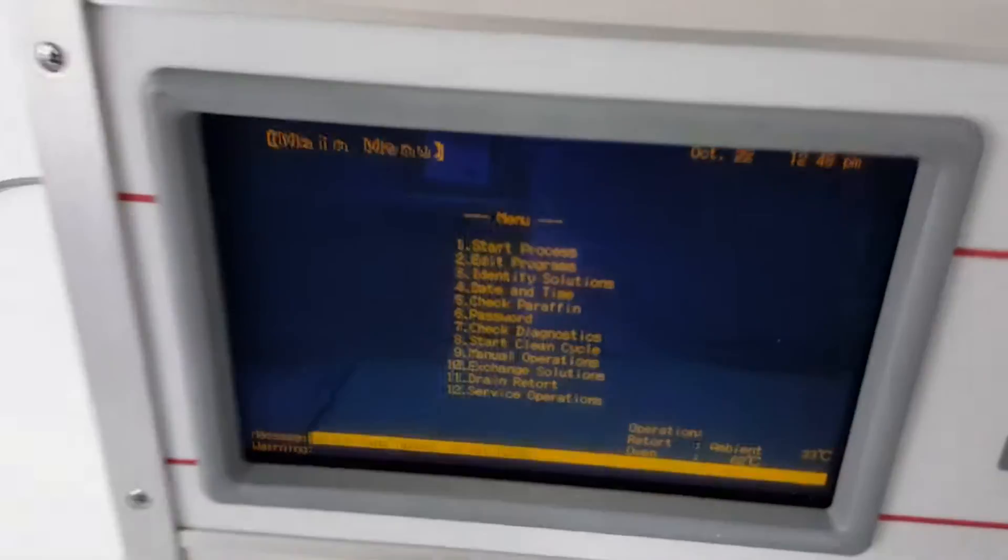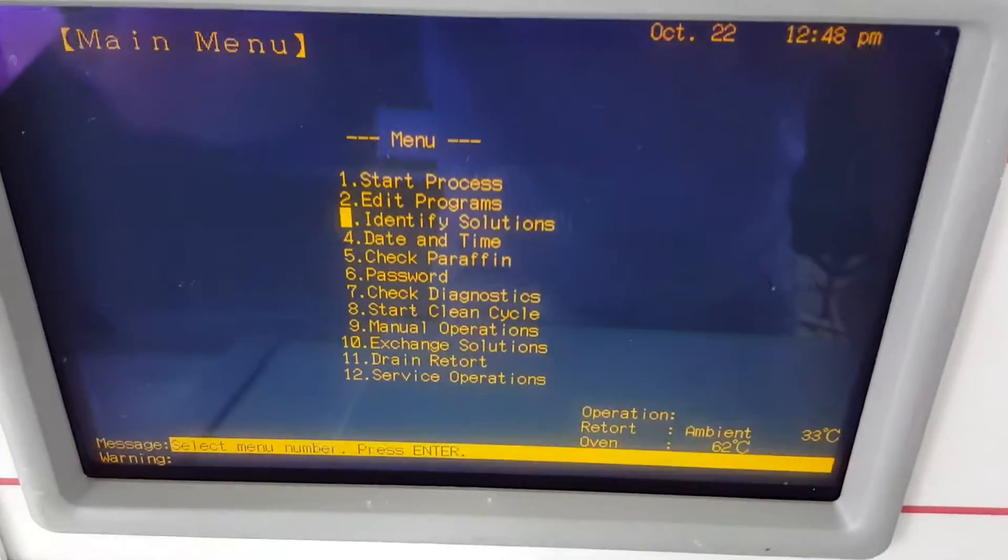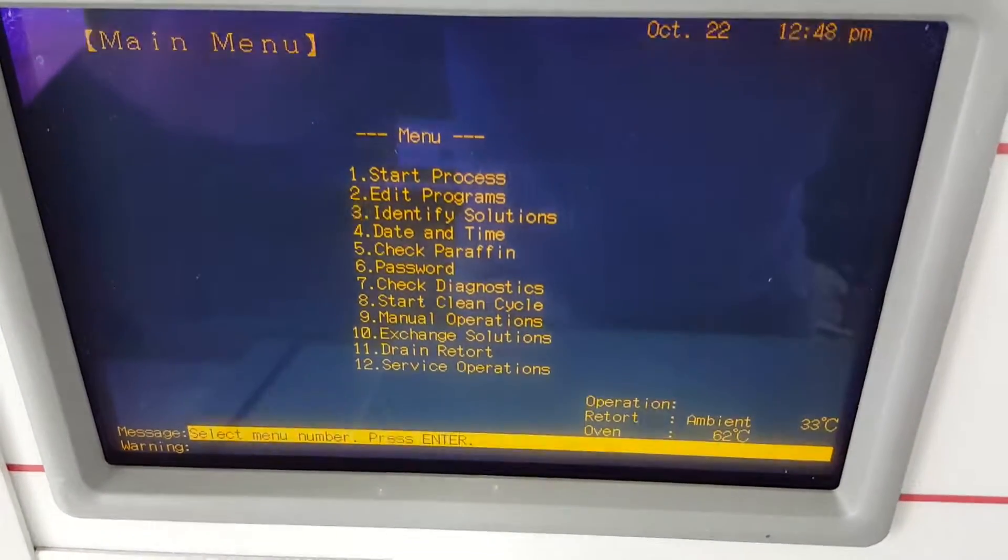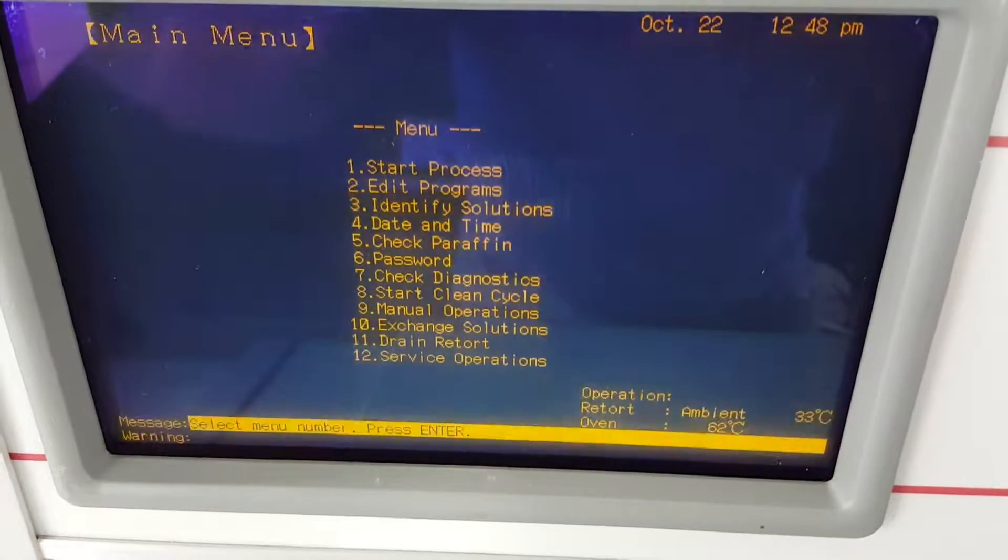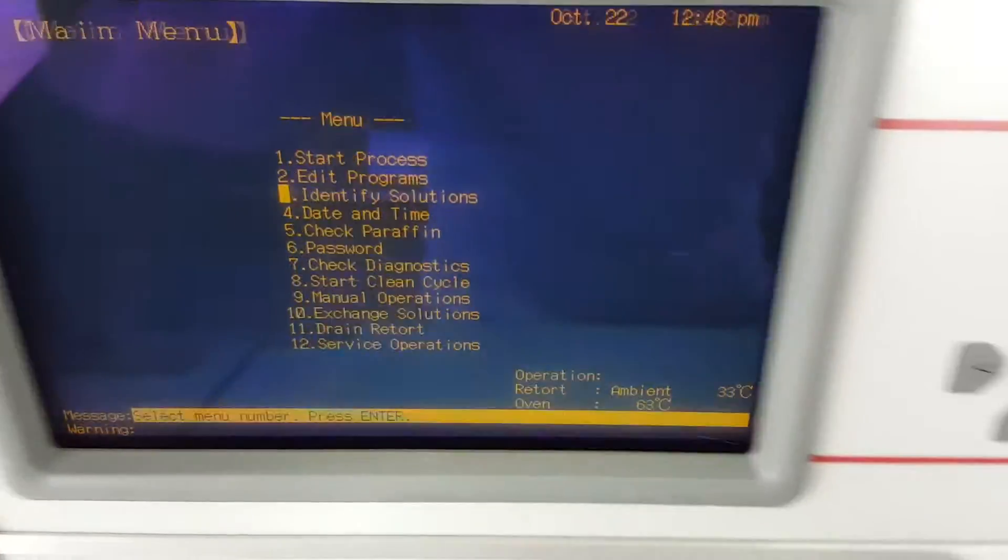So the main menu is going to look just like this. Where I'm going to go first is number three, identify solutions.